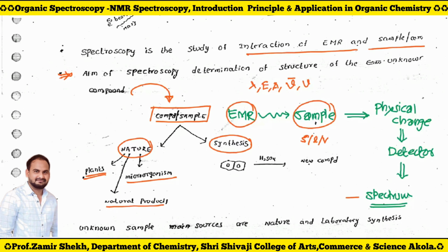Okay, and that spectrum is basically evaluated first. It should be evaluated, otherwise all of it is useless. You must evaluate that spectrum, because the spectrum has some numbers. Spectrum has some type of lines. Okay, these are called the type of the spectrum, so it should be evaluated first.